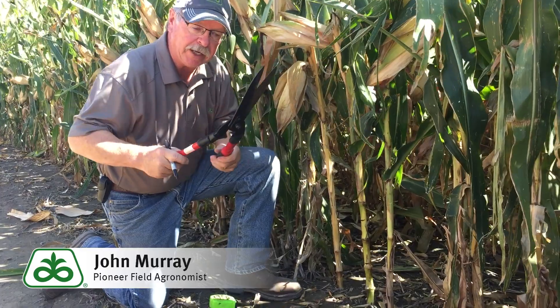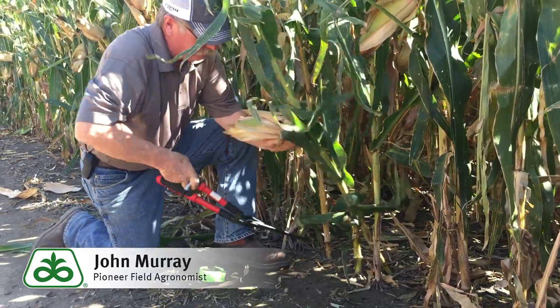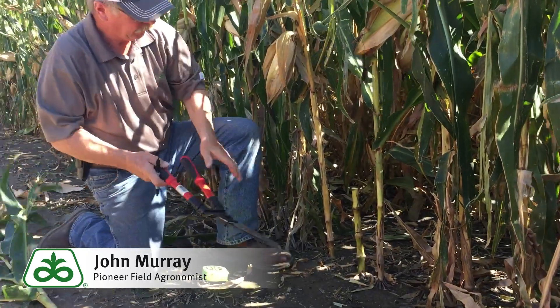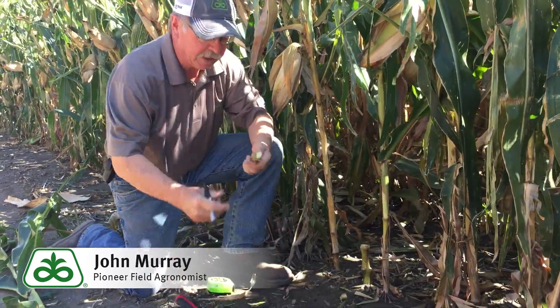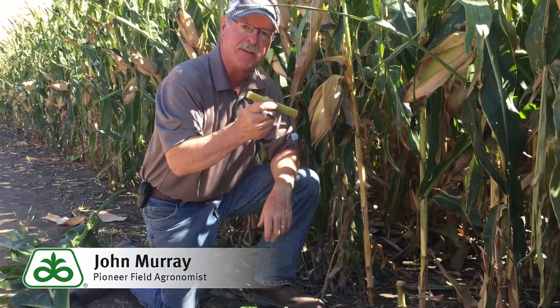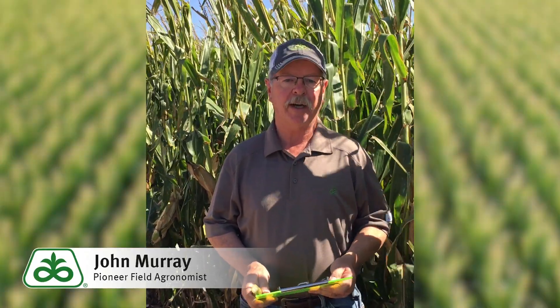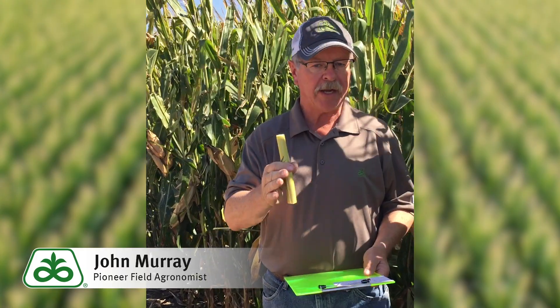Take your loppers or hedge trimmers and simply cut this section off. This is the piece of stalk you need for your test, and you'll want 15 of these for the overall test. Go to a representative area of the field, collect 15 stalks scattered throughout that given area, and randomly collect them for this test.